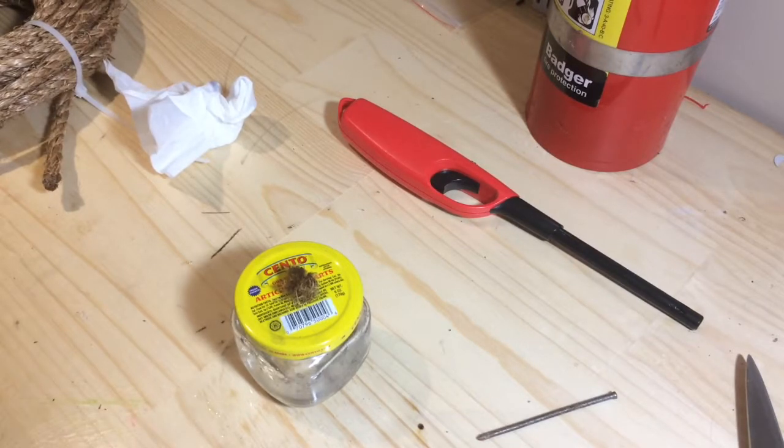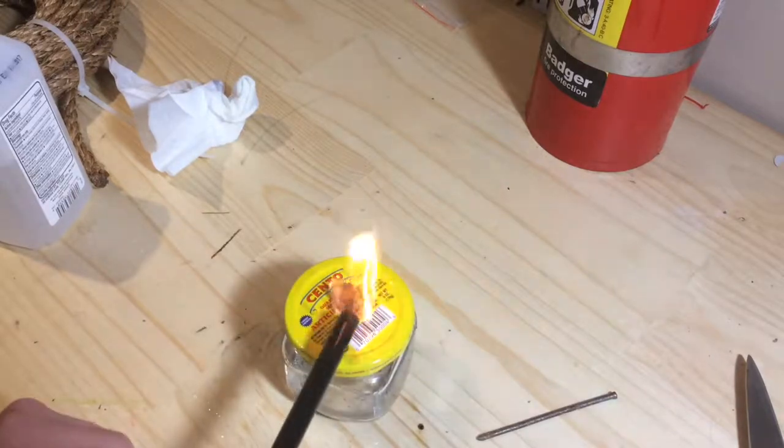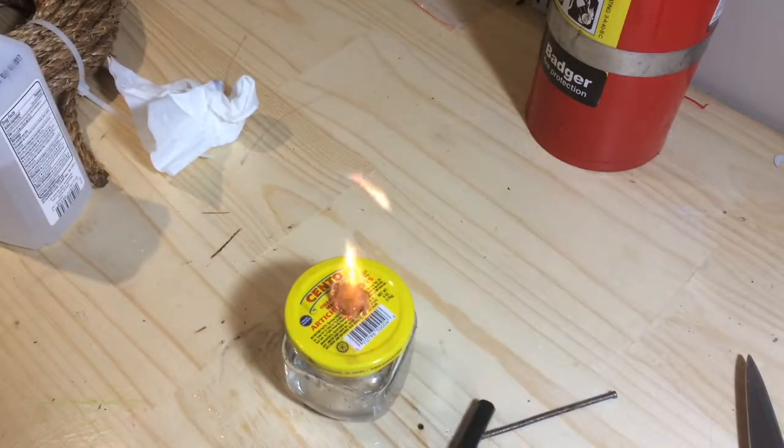Alright, so now that you've done that, take your lighter and light it at the top. That is your DIY Bunsen burner.